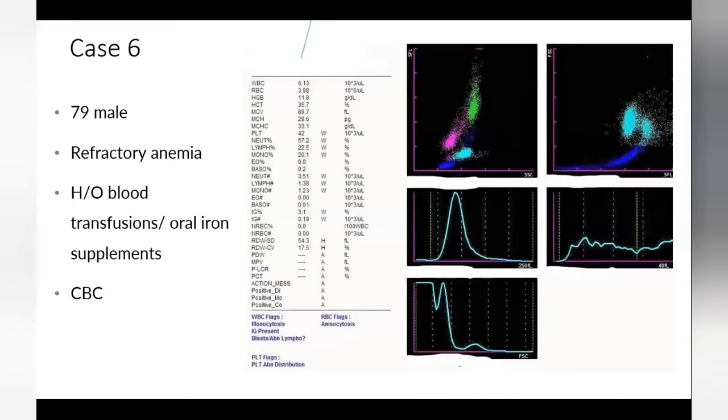I'm not sure how many of you are familiar with reading a flow cytometric analysis of the scatter plot, but if you look at the side scatter on this particular case, the neutrophils have a much lower side scatter than they should usually have. So that itself should give you a clue that the granularity of the neutrophils is reduced. Obviously a low side scatter means lesser granularity, and the neutrophils have not really clustered where they should ideally be. And he's 79 years old, he's got refractory anemia.